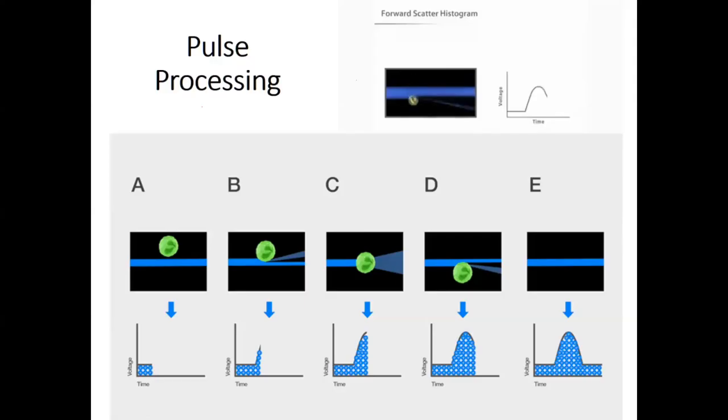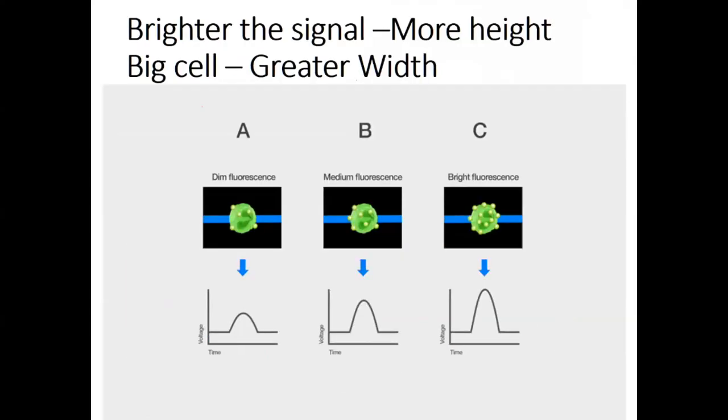Similarly, 1 lakh side scatter pulses. Similarly, 1 lakh fluorochrome A pulses, fluorochrome B pulses. So you get so much data, right? That is called the data, and you have to analyze this data with software. It can be third-party software or acquisition software.